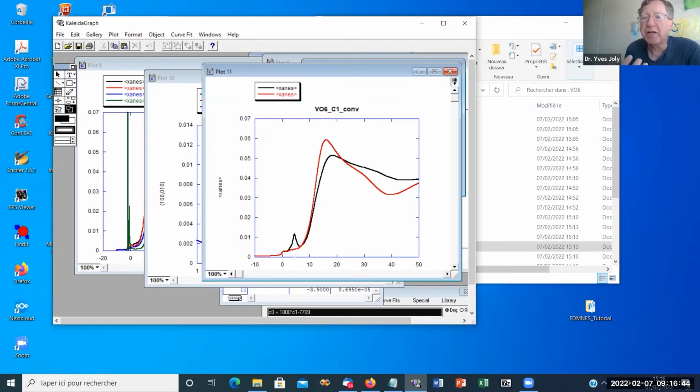And because the dipole channel is easier, it gives more intensity than the quadrupole channel, even if you have only a small amount of p state. Anyway, the bump corresponding to this transition becomes far more important than the bump corresponding to the quadrupole part. Okay. And this explanation shows that you need to have this state in the non-occupied states, because by this way, you can see them with the XANES. And so you can see eventually the hybridization with p state.